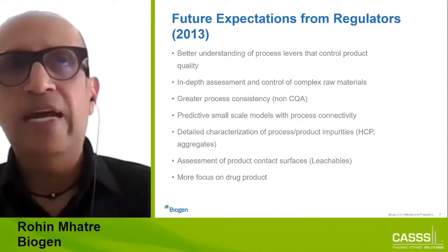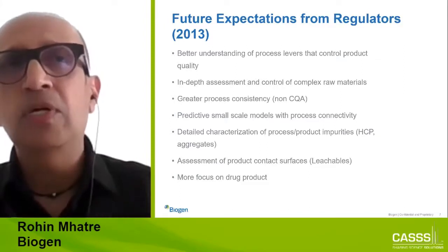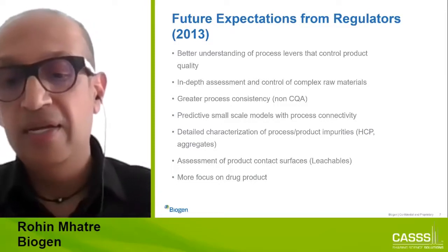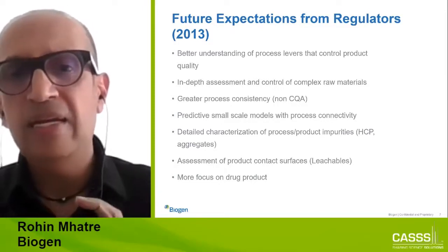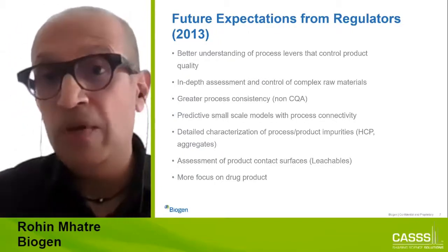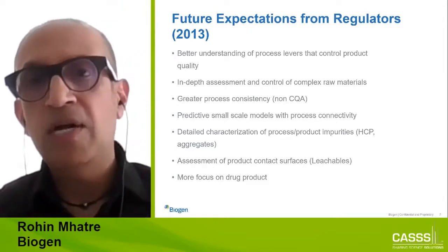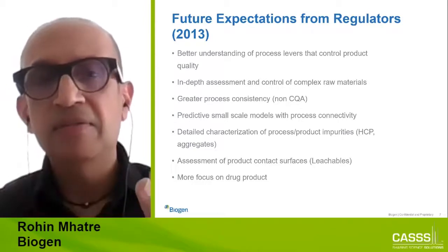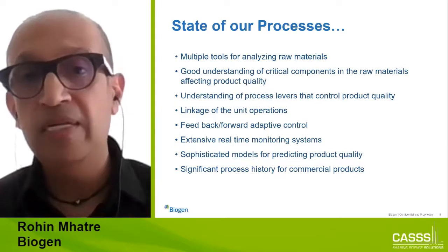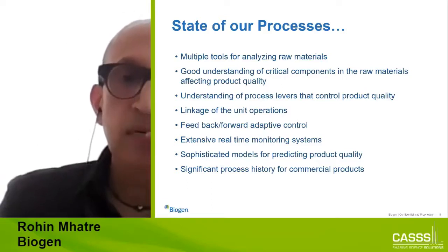Some of it may involve actual measurement with tools, could be simple tools like sensors and so on, could be far more sophisticated tools, getting into the area of mass spec, even 2D chromatography and so on, but then eventually using models. So this is what I had said we were working on, and this is where we are fully embedded right now. I won't talk much about the product and so on, but nonetheless, having talked about this is really where I feel things are. And a number of companies over the years have shared where they are. So many of our peer companies, I feel, are in this space.